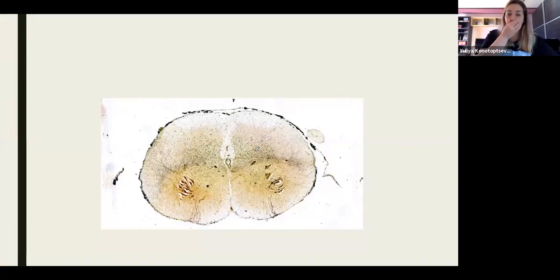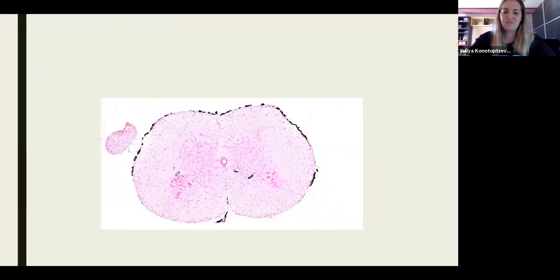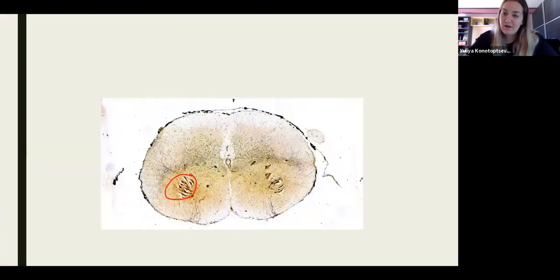Okay, guys, these are additional slides that you have, but they are not going to ask you on the self-control test. These slides are just to show you how big the alpha motor neurons are. There are different sections, and you can see that alpha motor neurons are definitely the ones which stand out. They're the biggest ones in the spinal cord. It won't be in the exam. It was just there to show you them, but that's it.